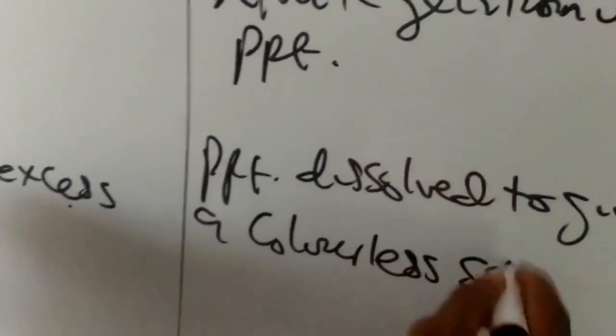Now the cations that will give us white gelatinous precipitate when we add ammonia in drops are only 2, zinc 2 ion, or aluminium 3 ion present. That comma means or.